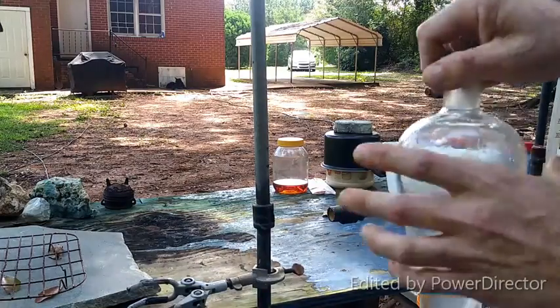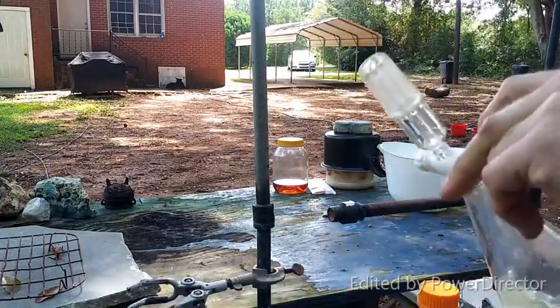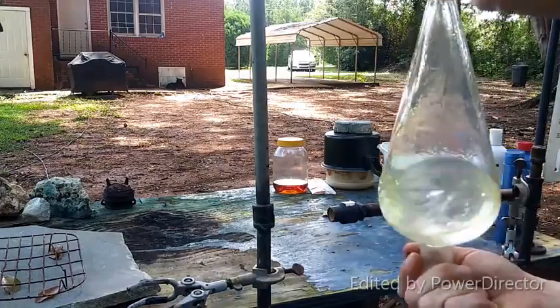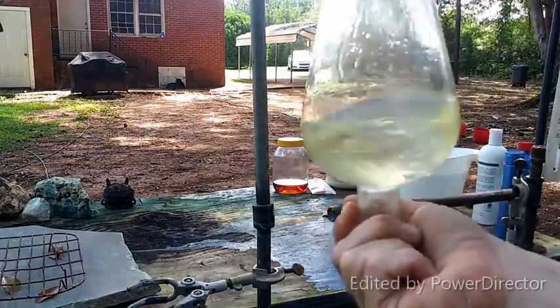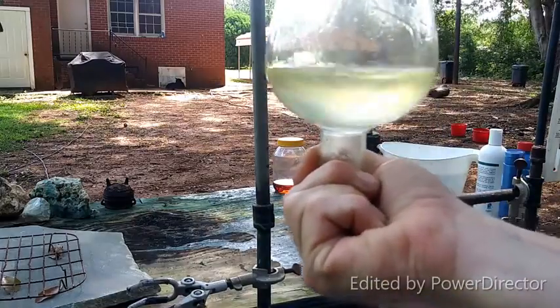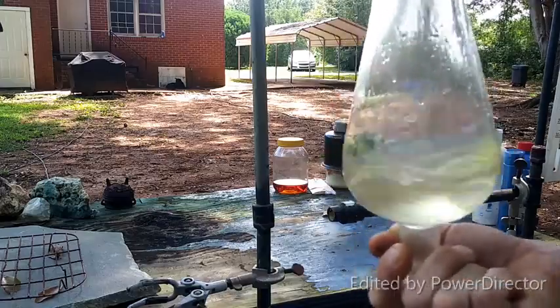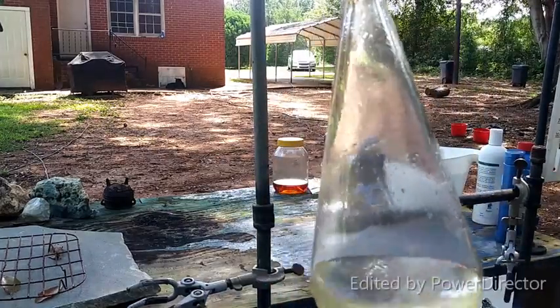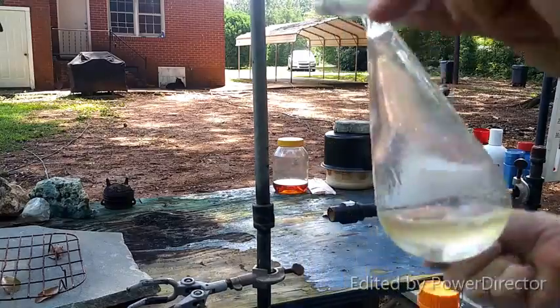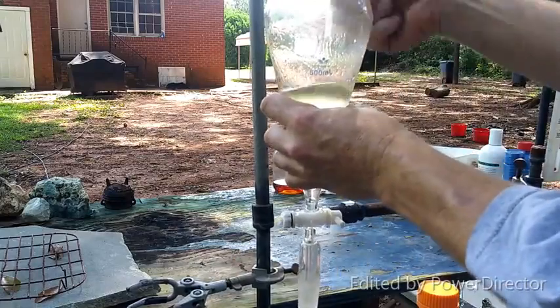Don't worry, we're going to dry the product too here in a little bit. Come on, get your chunky ass down in there. You guys see this? I don't even know if you can see this. Look at that. We did pretty good removing the iodine. Now, the presence of iodine is not going to harm what I want this for, so I'm not going to stress over it too much.